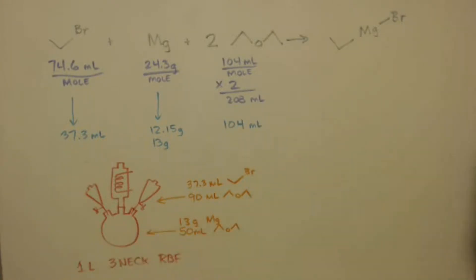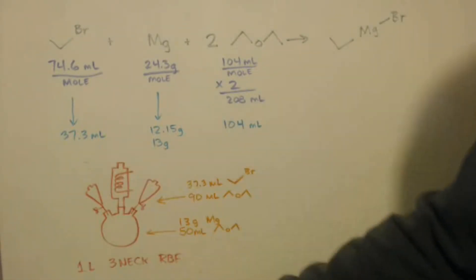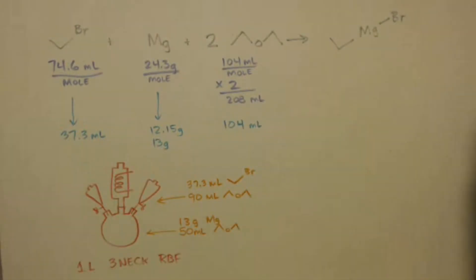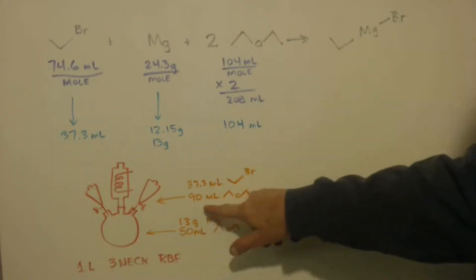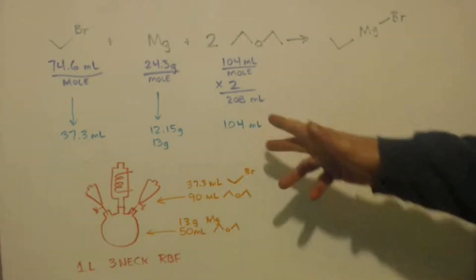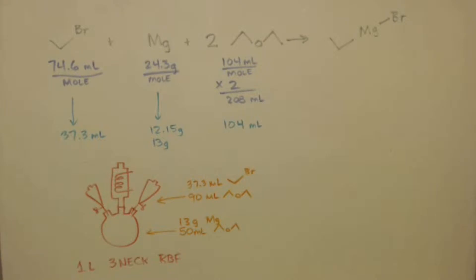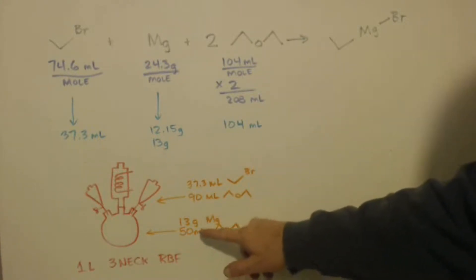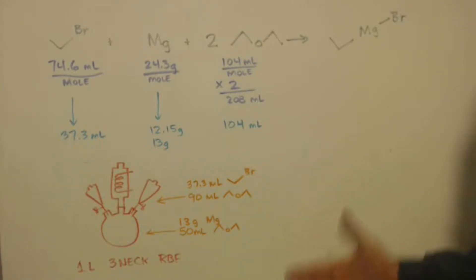Here's my setup: a 1000-milliliter three-neck round-bottom flask with a condenser on it and two separatory funnels, also called equalizing funnels. The first funnel has 90 milliliters — I need 104 milliliters to get the right ratio, so I have 90 and 50, that's 140 milliliters, which is more than I need. I want to have more.